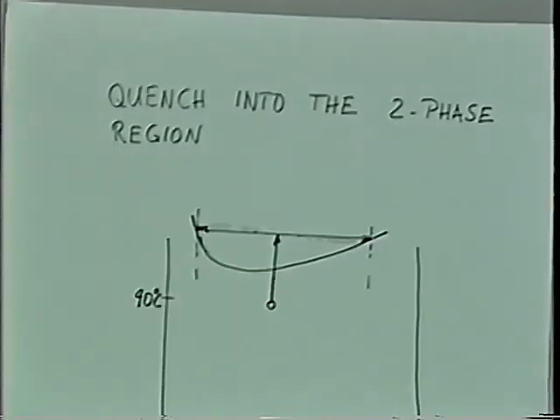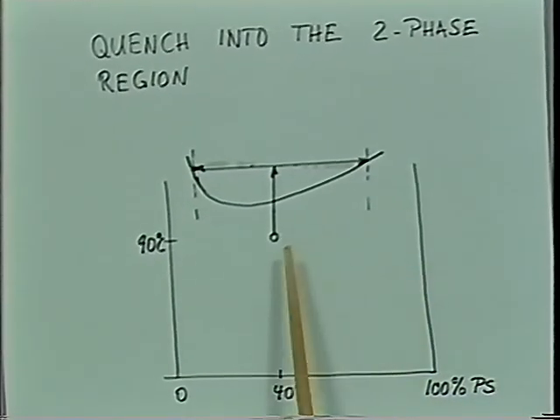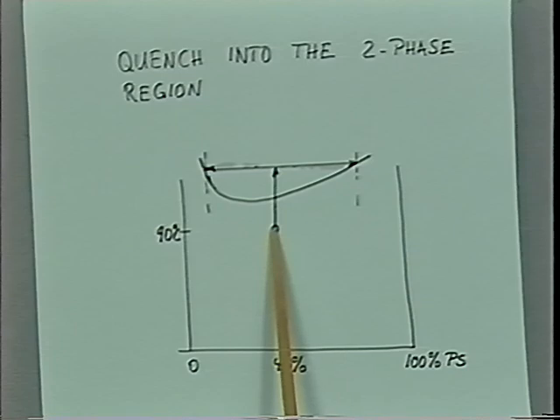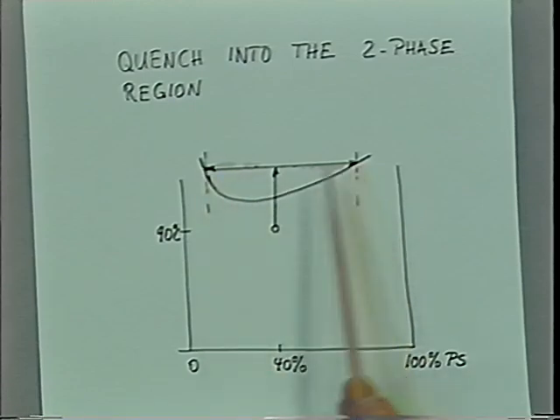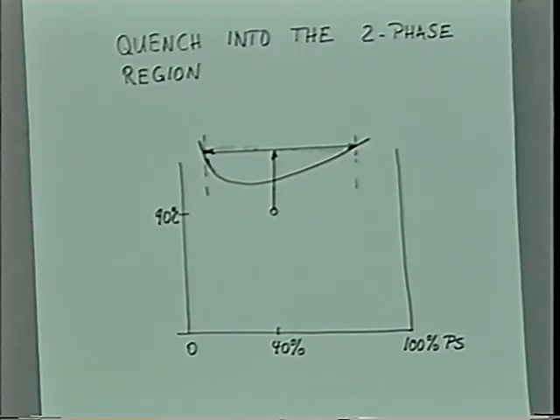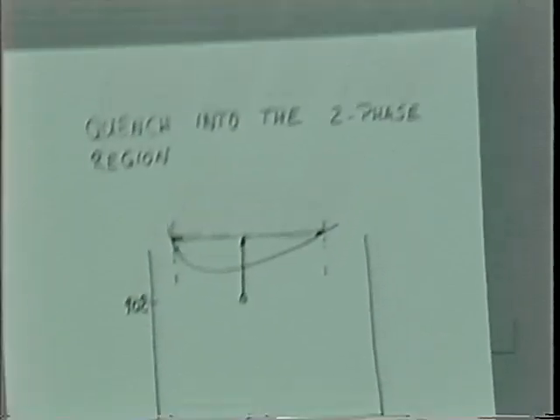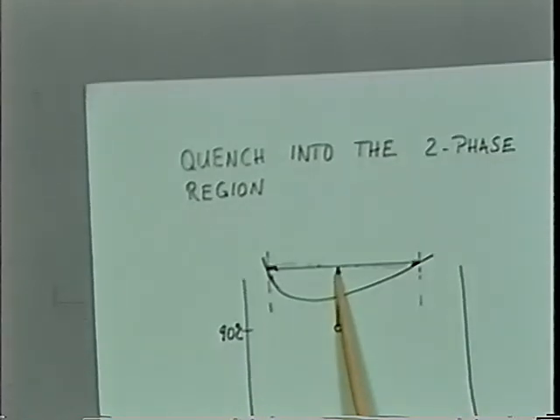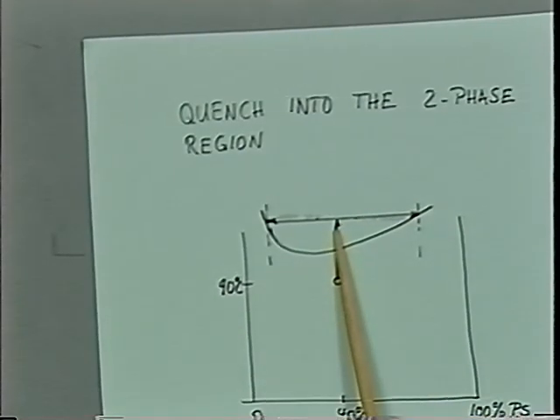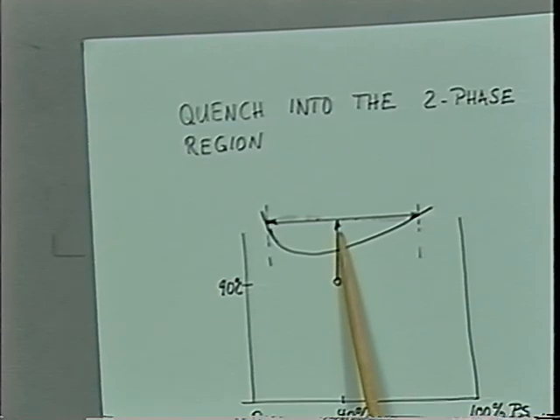For performing rheology, we are quenching the sample. So we start at 90 degrees, where the material is one phase. We go to the two phase. It decomposes into the two components, the polystyrene-rich and PVME-rich components, and both of them are very asymmetric. It needs a while for the structure to develop. So after quenching here, one has to stay with the sample and wait till a stable rheological response has developed.